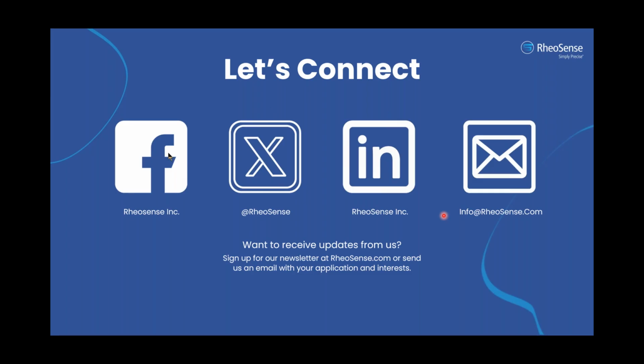So here is a question: have you published the viscosity of plasma samples of multiple myeloma patients? The only study that we published is an app note that we released, where we compared the viscosity from a patient with healthy serum with another sample from a patient with multiple myeloma. If you want, we can send you that app note, or you can access it for free through our website. You might be interested in reading that. That's the only one that I know of.